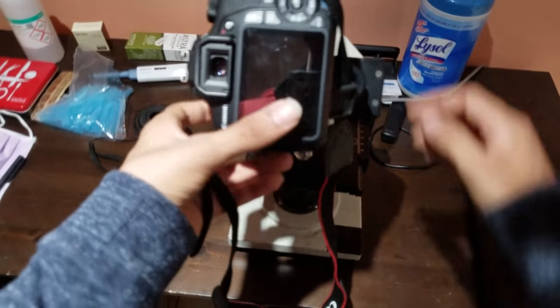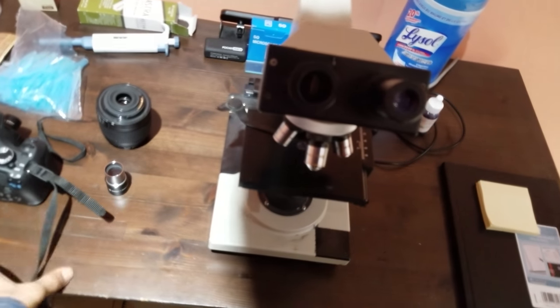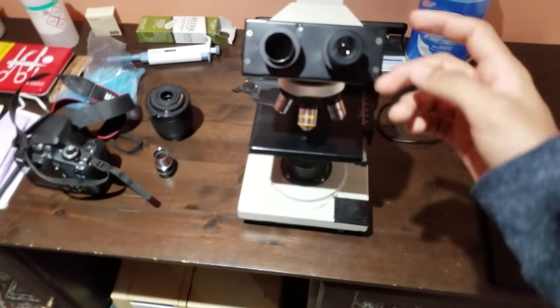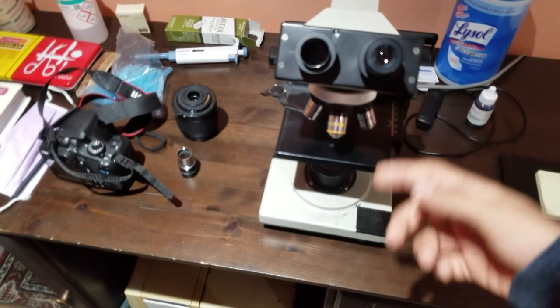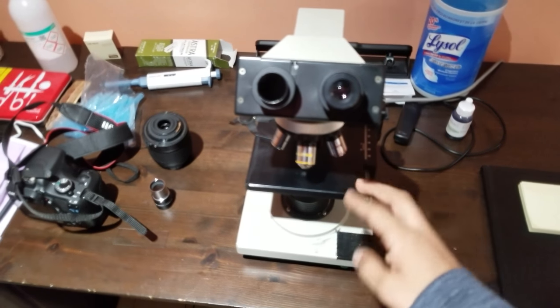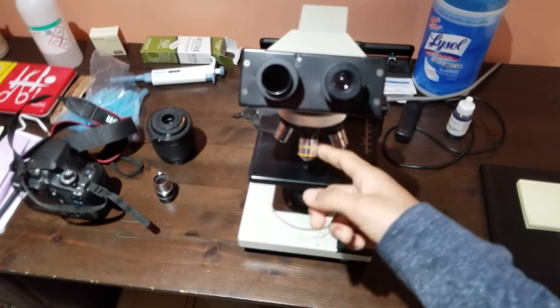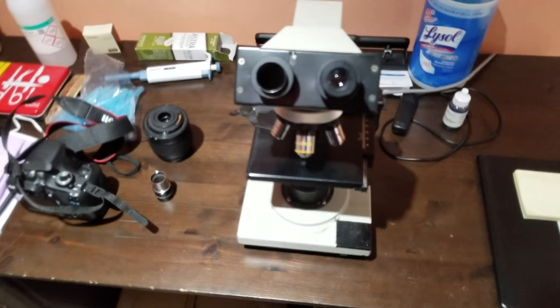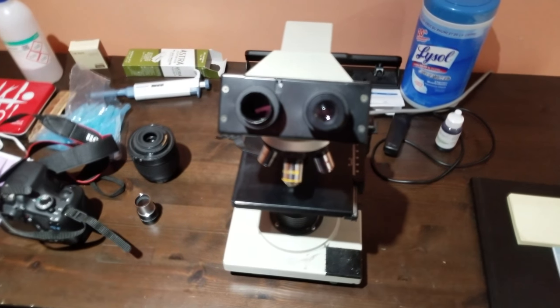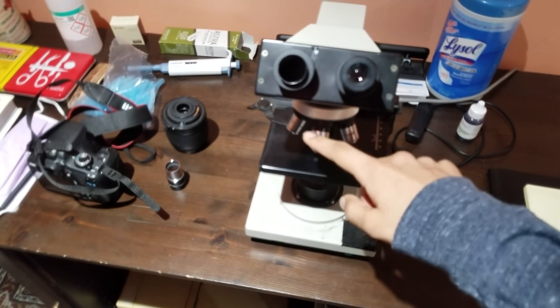get a clear image. One common problem that sometimes comes up is if you use a slide that has a cover slip on it, sometimes the camera cannot focus because the focal length differs between your eyes and the camera. And so a clever trick and a simple trick to avoid that problem is if you have a dry mount slide, so you're not going to risk damaging or getting your lens dirty, you can just take the cover slip off and use the slide alone. And that way you can focus better with your microscope camera without risking getting your objective lens dirty.